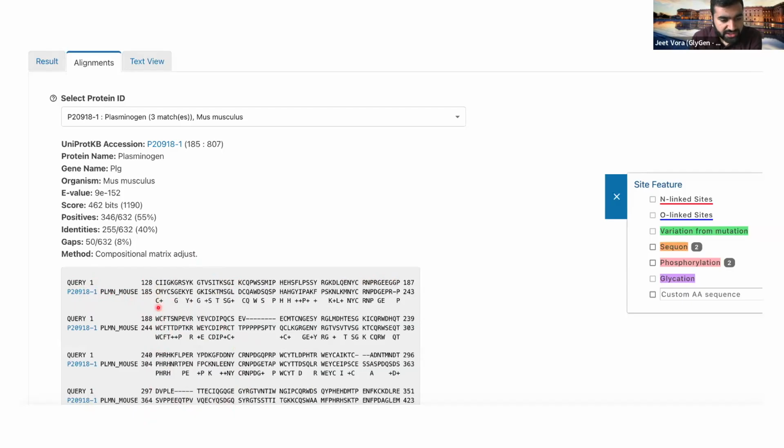And these are the conserved sites. If you know alignment, you would know a plus means these amino acids are similar in their properties. When there is nothing, no match or similar amino acids found, it is usually blank. And when there is a dash, it means there is an insertion or a deletion that has occurred. So this is how you can look at the alignment based on your input query sequence and the selected high scoring pair in the result.